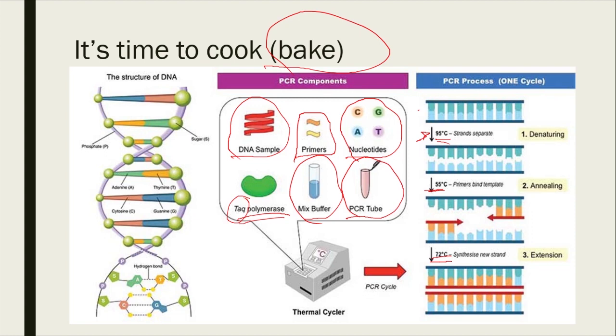So you're breaking it apart so that it creates a gap, so that the polymerase can start. But you need some starting point for the polymerase to recognize. So that's why we give some primer, which is the starting point for the reactions.